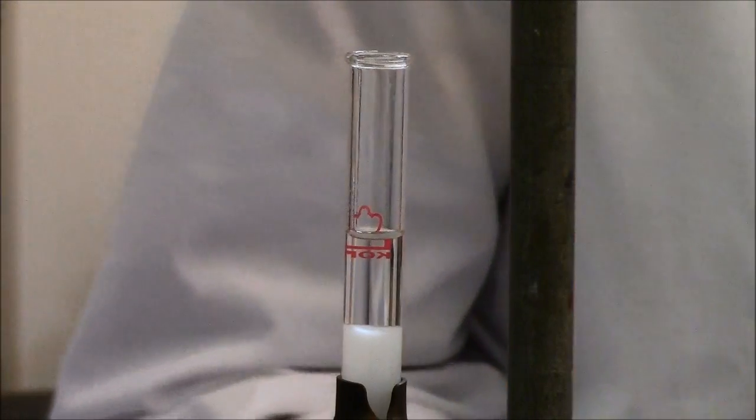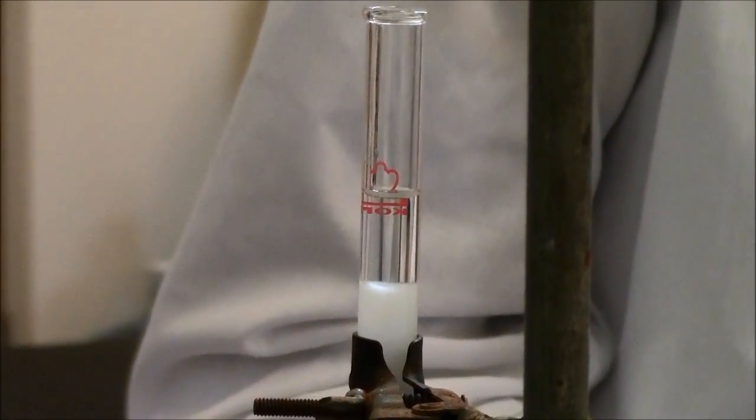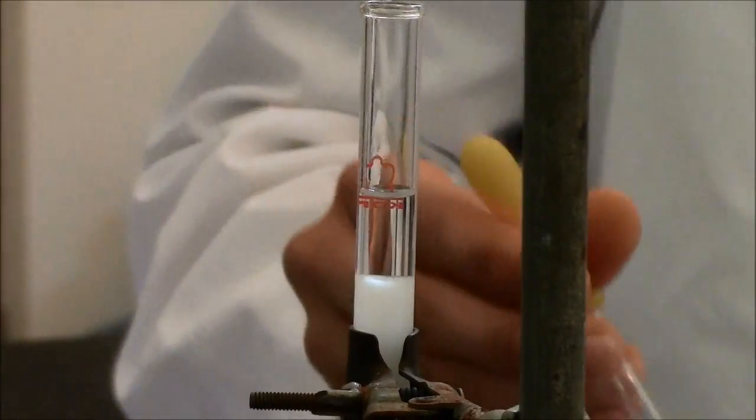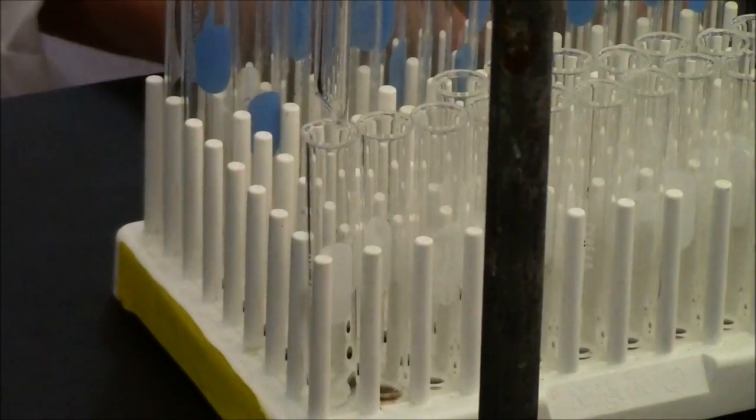There's no danger now of disturbing the sample. It's already an inch into the column, so no danger of disturbing it. So just keep that solvent full, and you probably should now start collecting real fractions, Morgan.